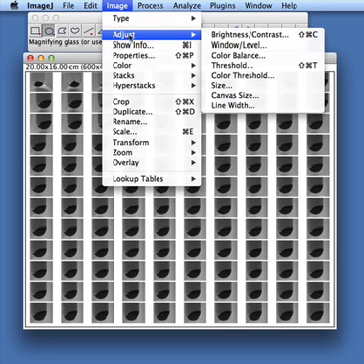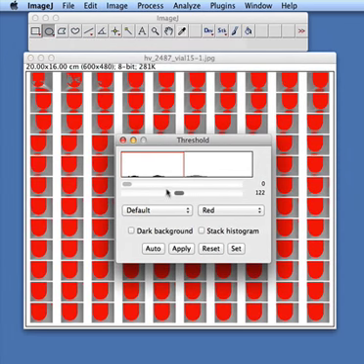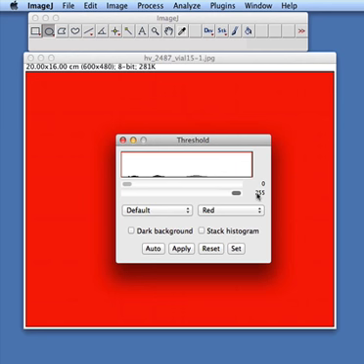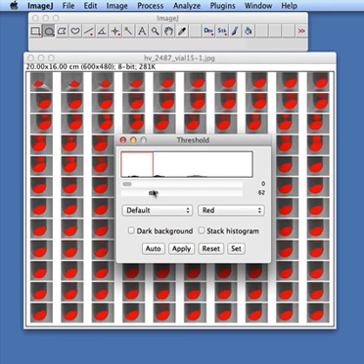And to do that, I'm going to adjust the threshold. So here we have two sliders. If I go from my 0 to 255 value, I will select everything, and I'm only interested in the coal, so I'm going to adjust this lower value until I only see the coal particle. In this particular case it's somewhere around the value of 47.